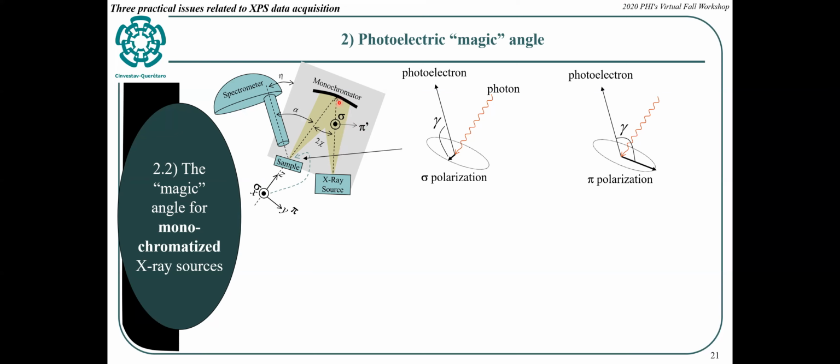So there are two different types of polarization defined by the crystal here: one is the sigma polarization, and one is the pi polarization. It happens that it is less likely for this crystal to reflect a pi polarization photon than a sigma polarization photon.